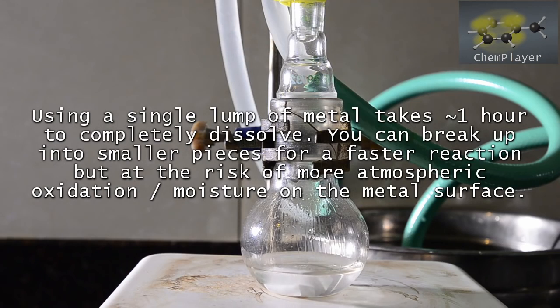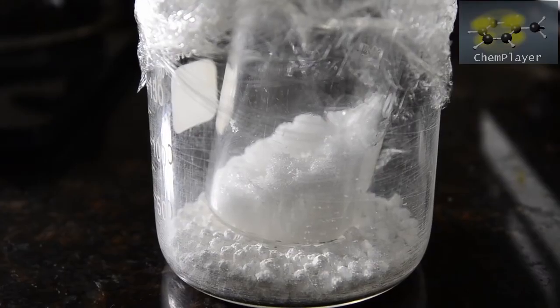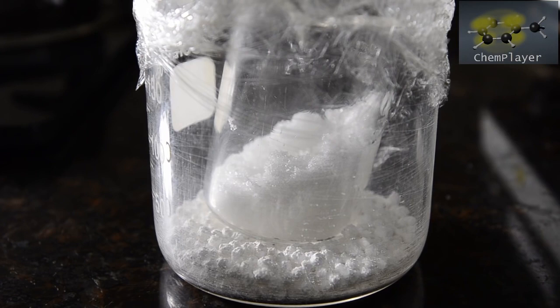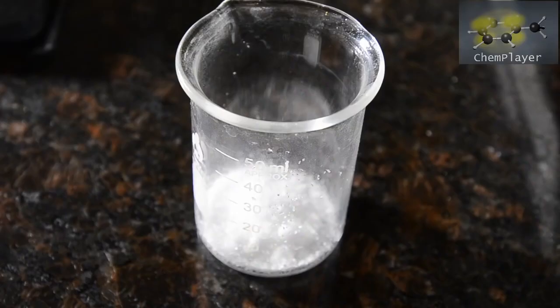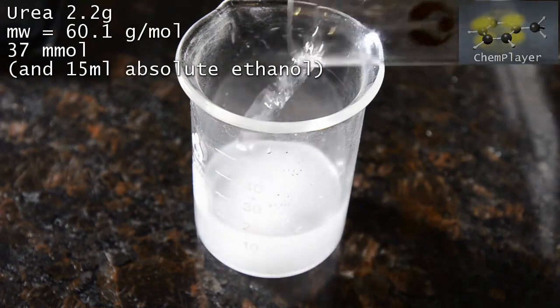Okay. While we're waiting for this to react, we're going to prepare the other reagents we need for the reaction. In this reaction, diethylmalonate condenses with a molecule of urea to give our product. We took some urea powder and placed it into a makeshift desiccator containing anhydrous calcium chloride for a few days in order to make sure it was completely dry. Then we weighed 2.2 grams of the dry urea powder into a dry beaker, and added 15 ml of absolute ethanol.